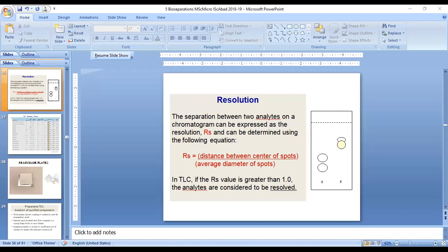So if the two situations are here, तुमच्या असं लक्षात येईल कदाचित की ह्याच्यामध्ये जर ते आपण कॅल्क्युलेशन केलं तर ती जी व्हॅल्यू आहे ती 1 पेक्षा जास्त येणार आहे इथे, आणि इकडची जी व्हॅल्यू आहे ती 1 पेक्षा कमी येणार आहे.